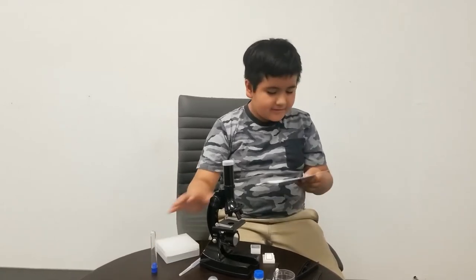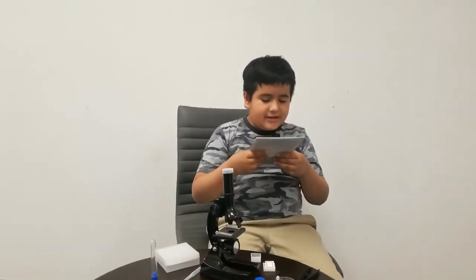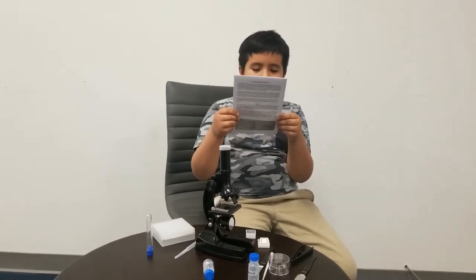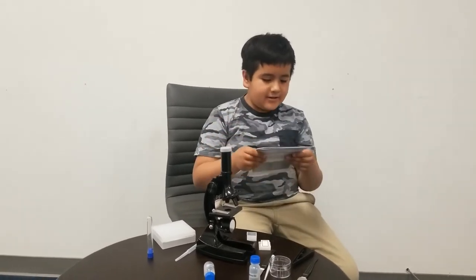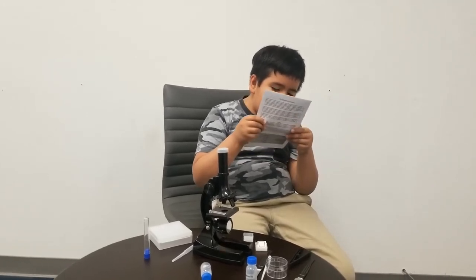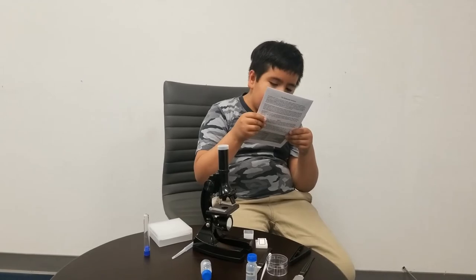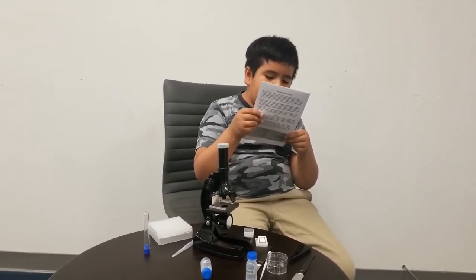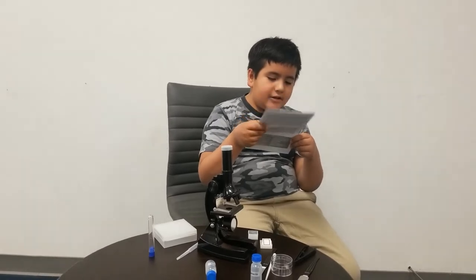Okay, I don't know what that is. Instruction manual, which is what I'm reading. And it says two AA batteries — not required for light source, not included — and one small Phillips head screwdriver.